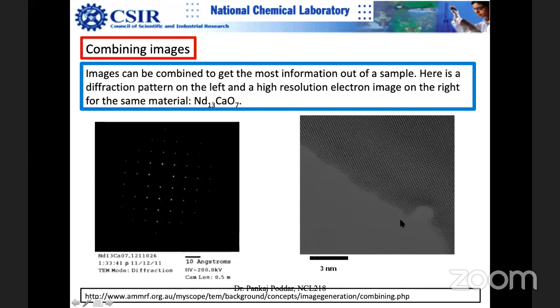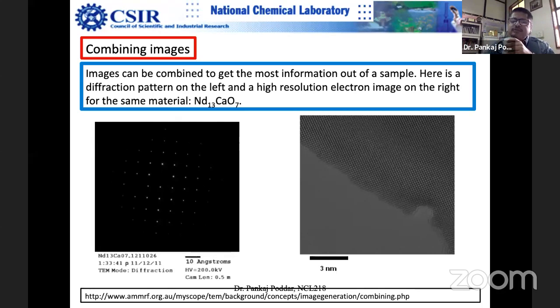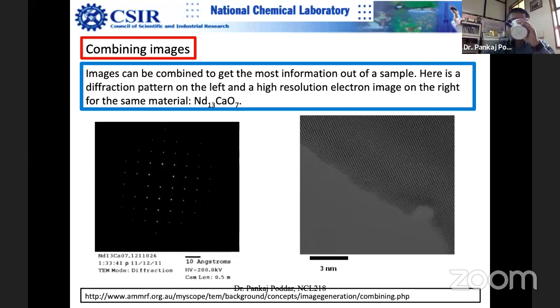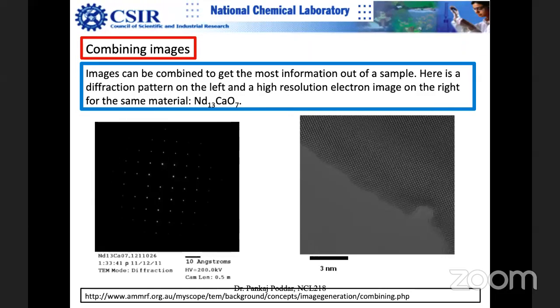Samina, any question? Sir, I have one question. Sir, when we do normal TEM, we get the SAED pattern. But when we do HRTEM, we get the FFT pattern. Then what is the difference between SAED and FFT?